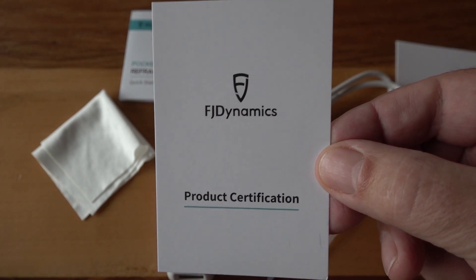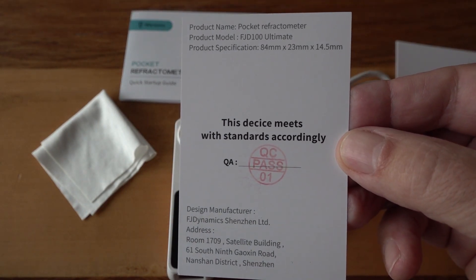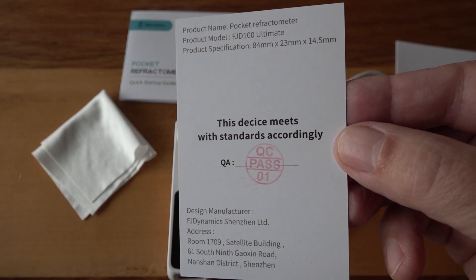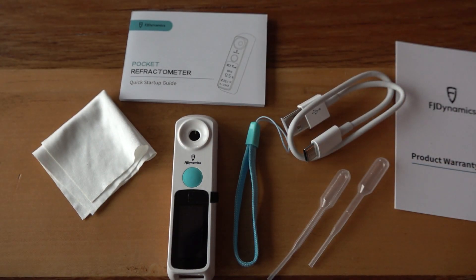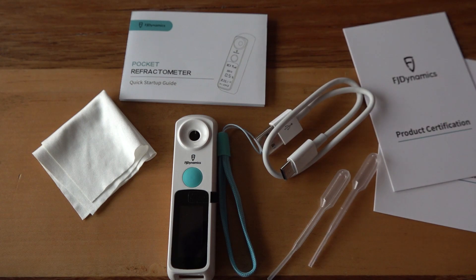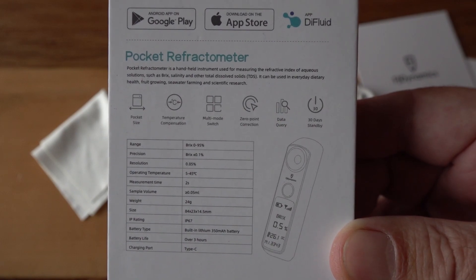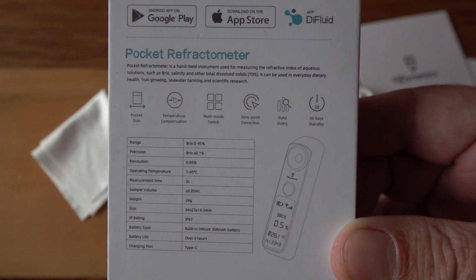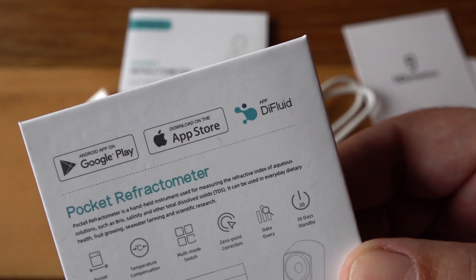Refractometers — this is a new one that came out by a company called FJ Dynamics. This is their quality control inspection card, but it also shows where it comes from — this thing is made in China. These are all the parts that come with it: pipettes, a USB-C charger, and everything else. They say it's a pocket refractometer, which is true — it fits right in your pocket. It's about three and three-eighths inches long and only seven-eighths inches in width.